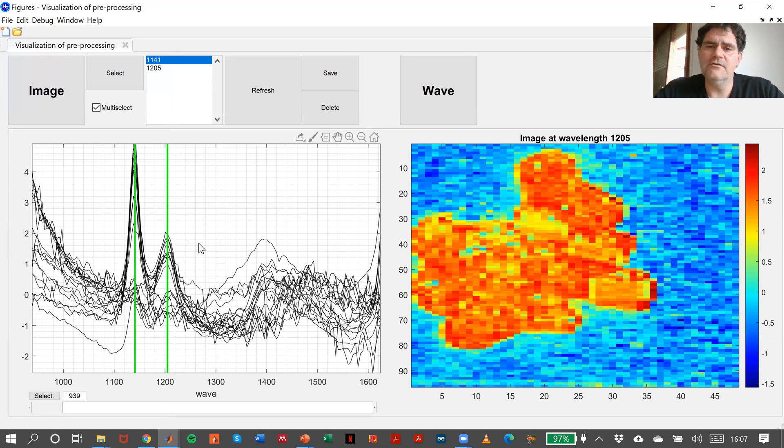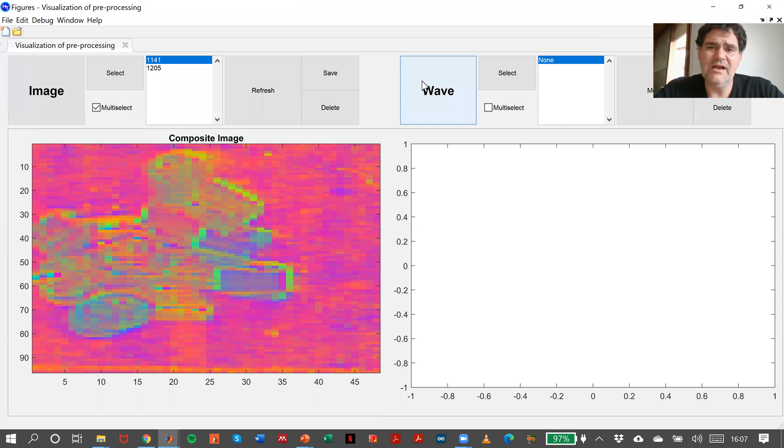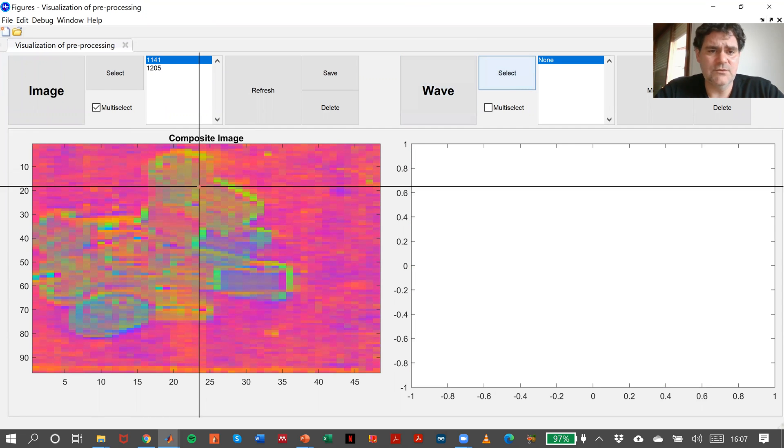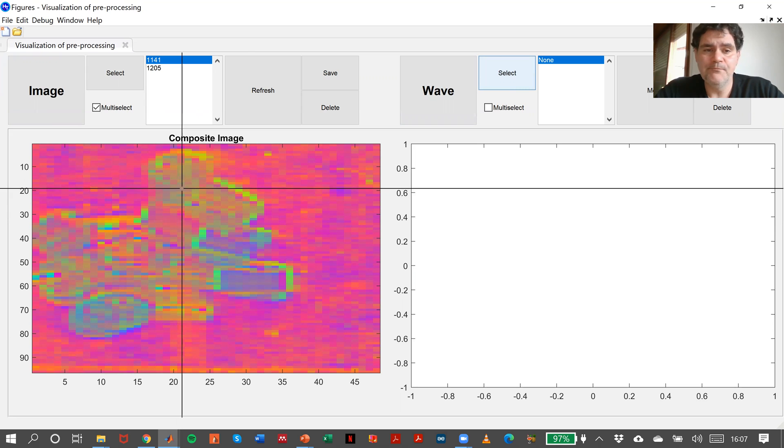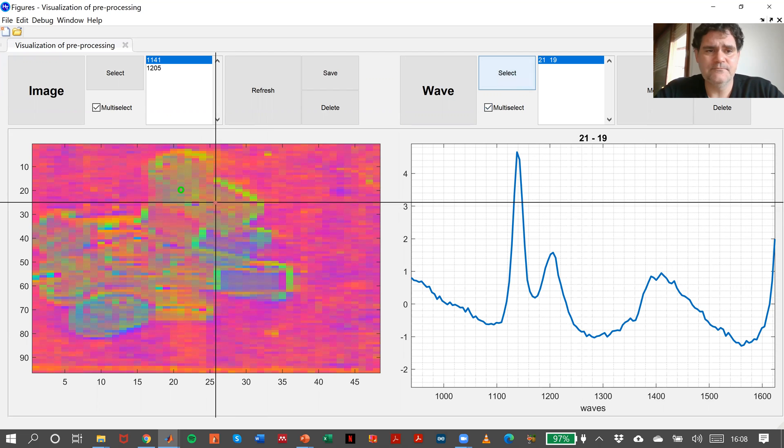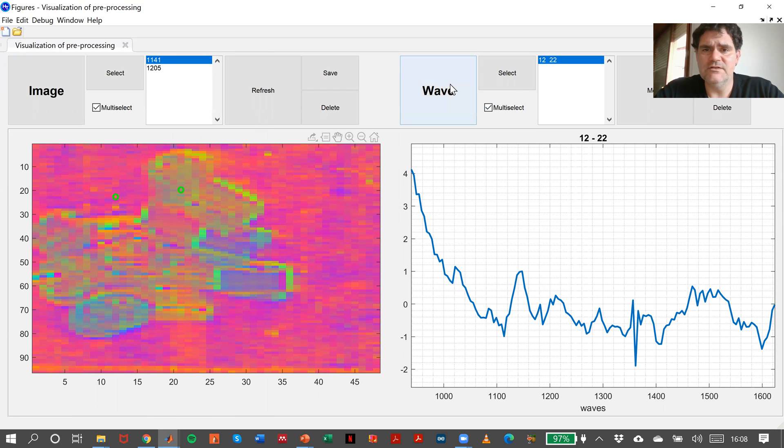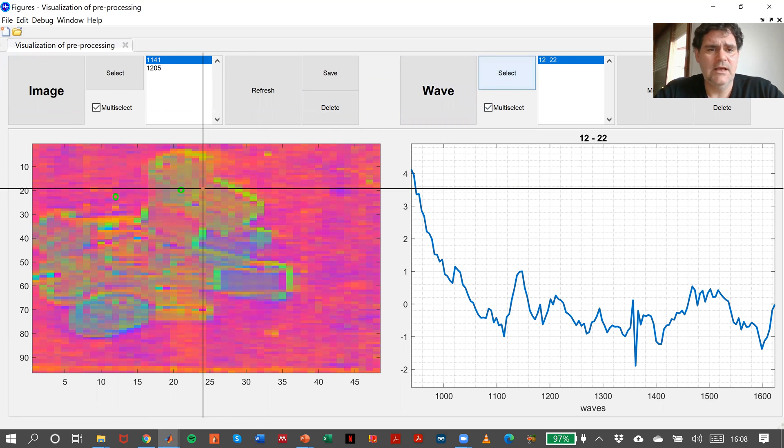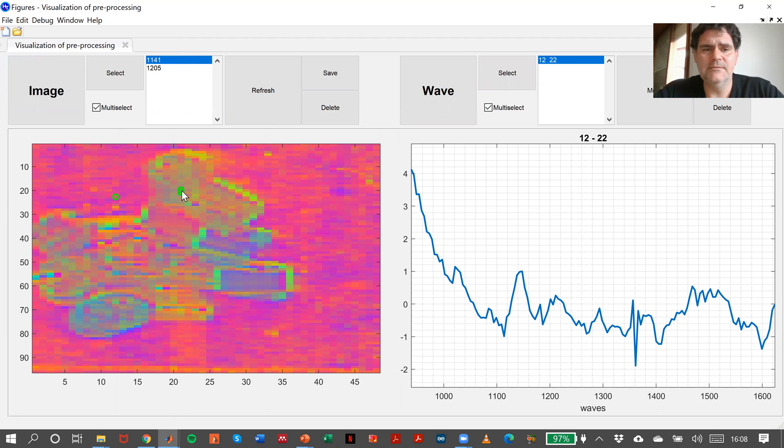or many wavelengths. Or even in the other way around, if we want to select or visualize the spectrum of one pixel or many pixels at the same time, for instance, this one and this one again.